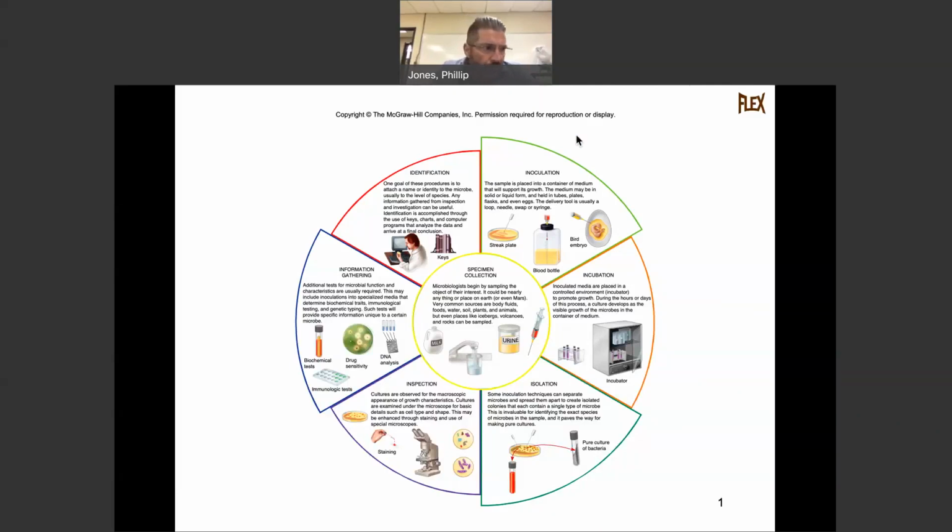So Tuesday, I gave all of you, if you're in lab, some agar plates, either a nutrient plate or a tryptic soy agar plate. These are just general nutrition media that most things will grow on. Your homework was to swab something, whether it was the bottom of your book bag or purse, or your keys, cell phone, keyboard, kitchen sponge, a flush handle on your toilet.